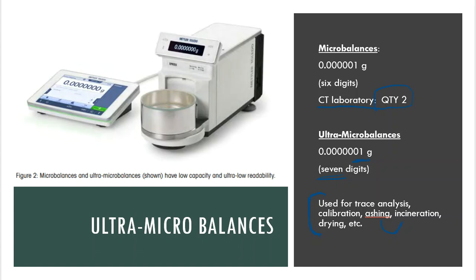And then finally, just drying laboratory tests. This is the idea that maybe something has water that is lingering behind, and we want to get rid of that water. We want to make sure that it's completely dry. So very often we have to go super, super low with those measurements if we want to ensure that all of that water really is truly gone out of that material.